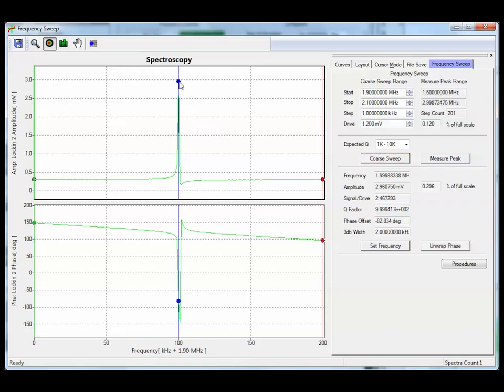We're much further zoomed into the peak. You see the phase shoulder here, as you would expect from theory, but there is still a phase wrap in here. We'll get to that later.